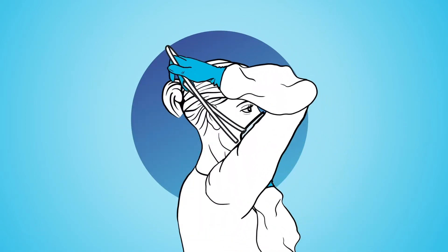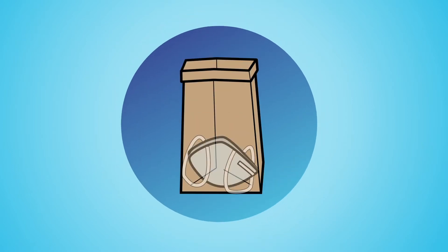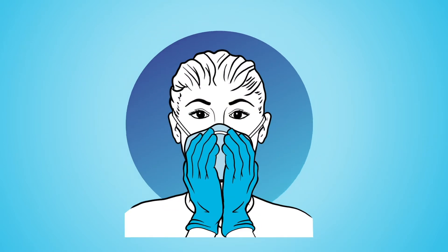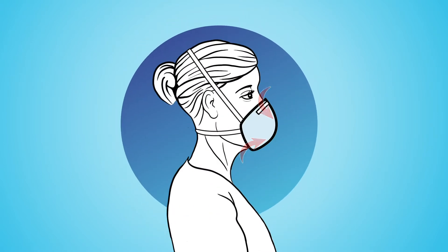In this video, we will show you how to properly don and doff your respirator for safe use when you are using a respirator multiple times to conserve supplies. If your N95 is not fitted properly, contaminated air can leak into the respirator and you could breathe in infectious agents.